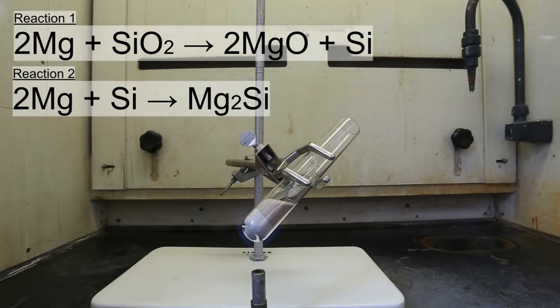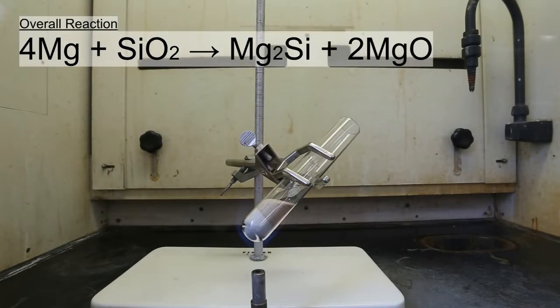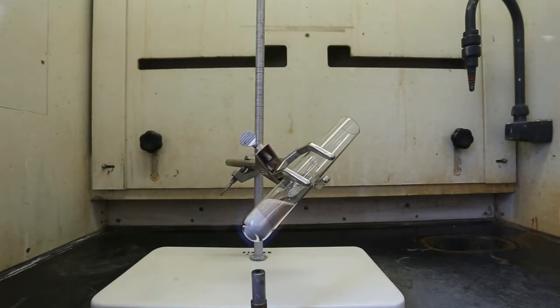Depending on how fine your magnesium powder and how fine your sand is, this reaction can be quite violent. The test tube will heat up immensely, and any magnesium remaining will react with the silicon metal that was produced in the first reaction. For this reason, we must use an excess of magnesium metal. The overall reaction is shown above, and from this reaction we can see that you need about 4 times as many moles of magnesium metal as you do silicon dioxide.